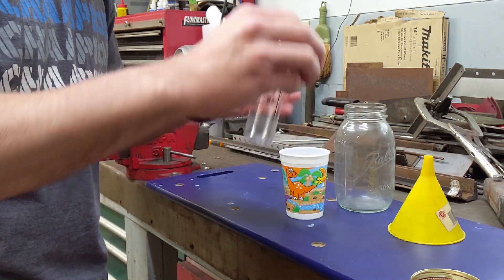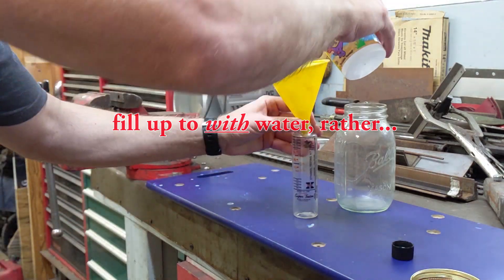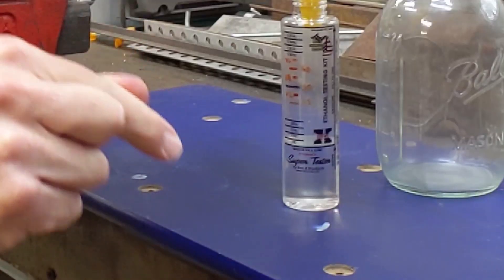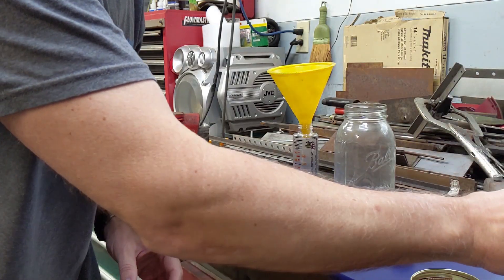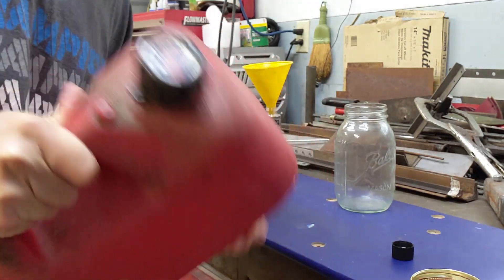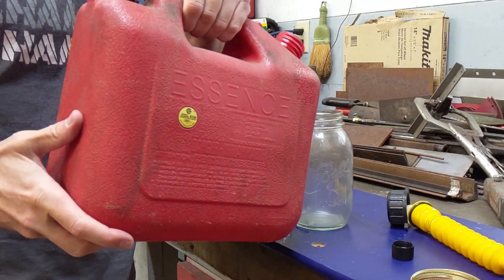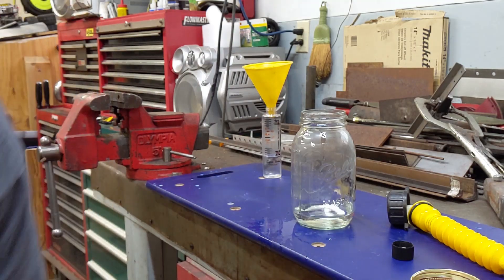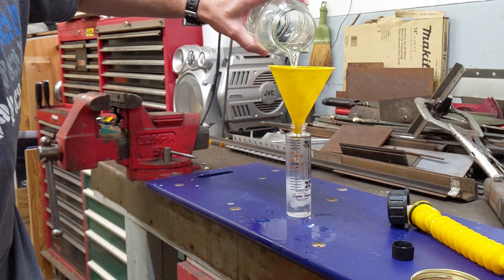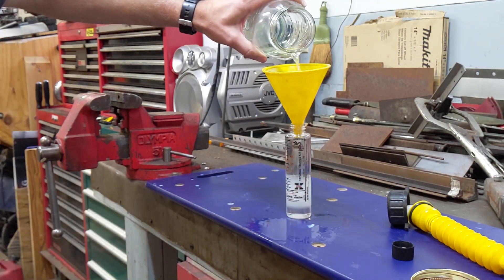Step one is to open up the cap. It's got a very specific line here that you need to fill to with water. Now you can't probably see it perfectly, but I guarantee you it's right on that line. The next step is to get our E85. I'm going to shake it up a little bit because the ethanol and gasoline can separate, and you want a representative sample of what's really in your jug. I'm going to pour a little bit of E85 into the glass jar, then pour the E85 into the tester right up to the top line.